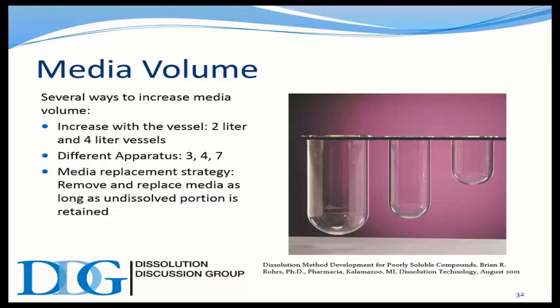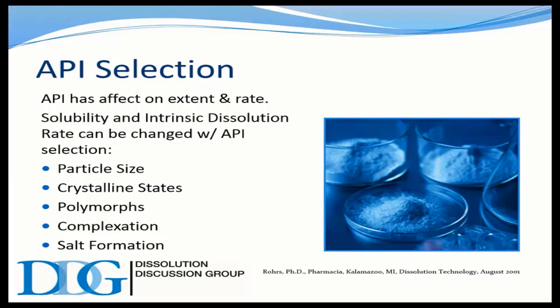Media volume. Just one note on that last slide, Brian. Sure. I do want to recommend to everyone, if you're dealing with an API supplier that you haven't worked with before or a new API, I always recommend doing some pretty extensive checks on that to make sure that the API is what the certificate that comes with it says it is. A lot of my customers have had issues with bad incoming API or it being very variable from lot to lot. So just wanted to point that out. No, a really good point.